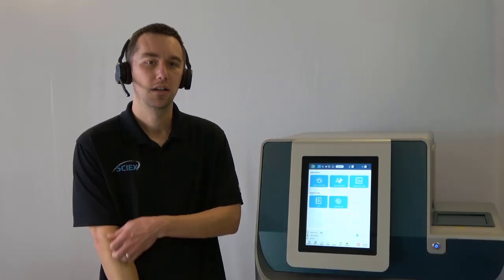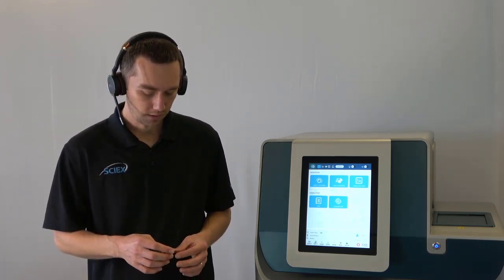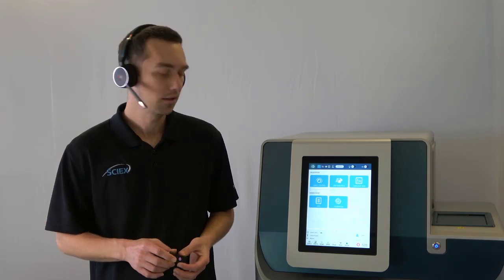So we can start our sequence, say, with our first 5 samples with LIF detection, and go to the next 5 samples with UV detection with no user involvement. Now, our method that we'll be discussing today, the CE-SDS analysis with laser-induced fluorescence detection, does use a more unique filter, a 600 nanometer filter, for our fluorescent dye.